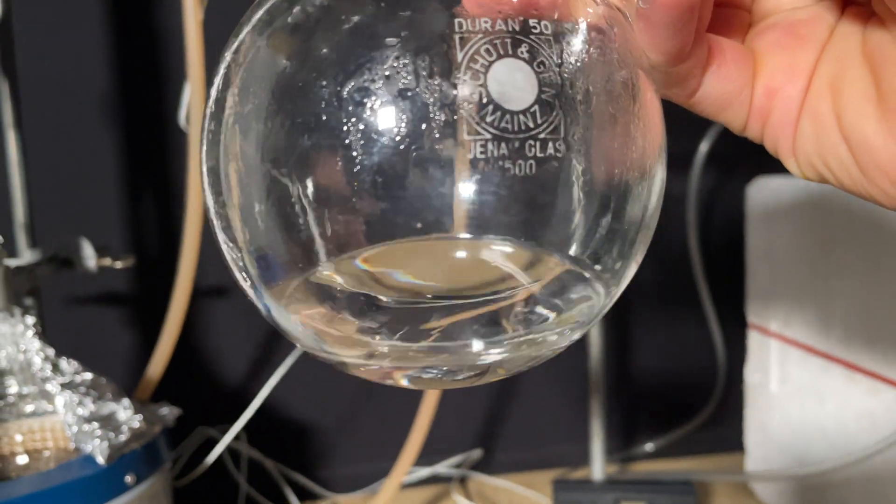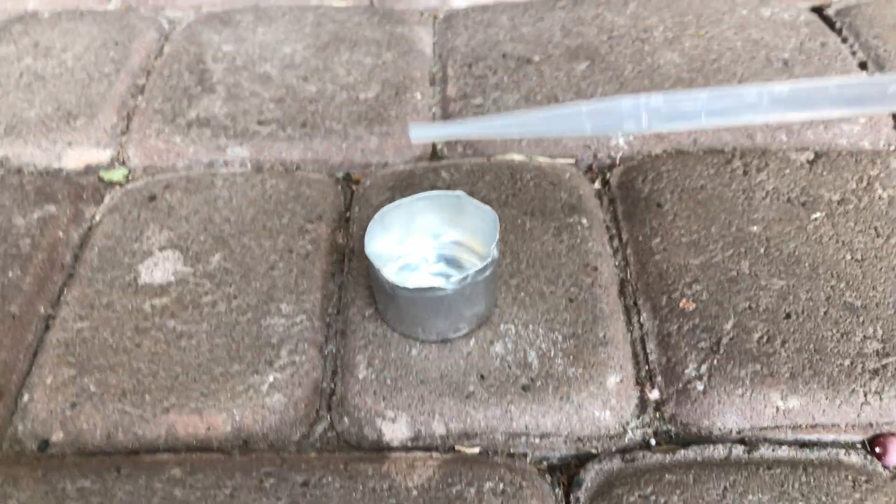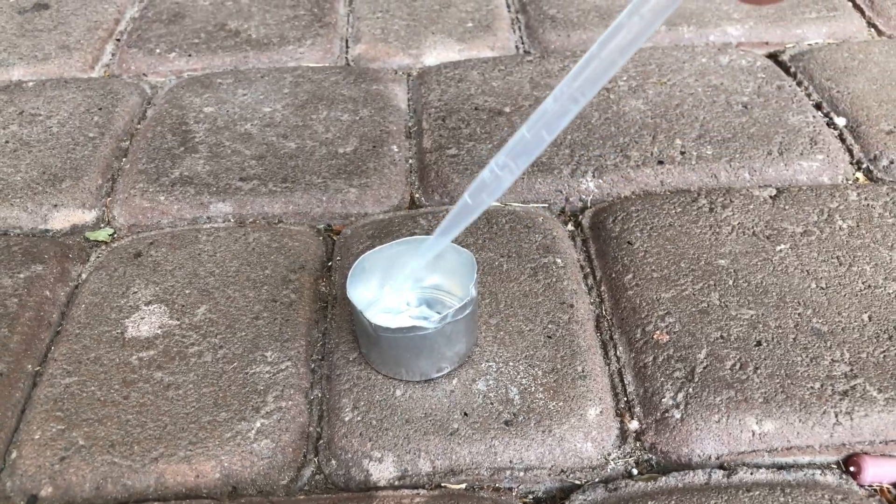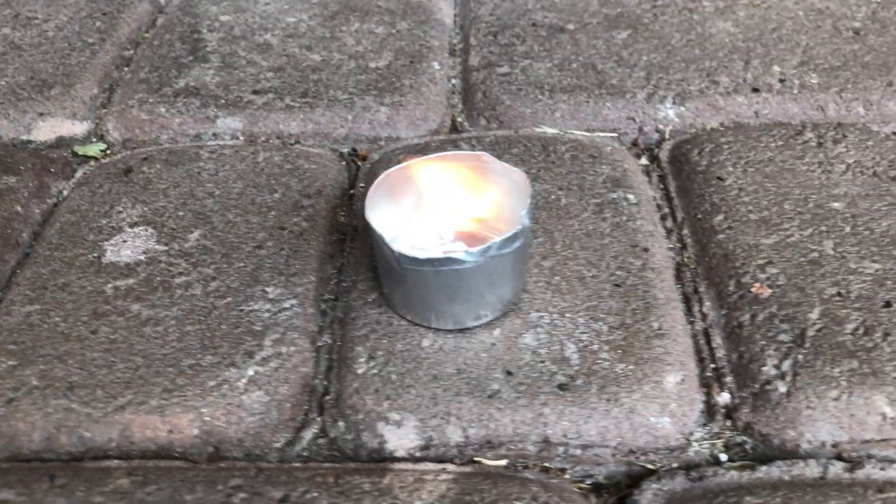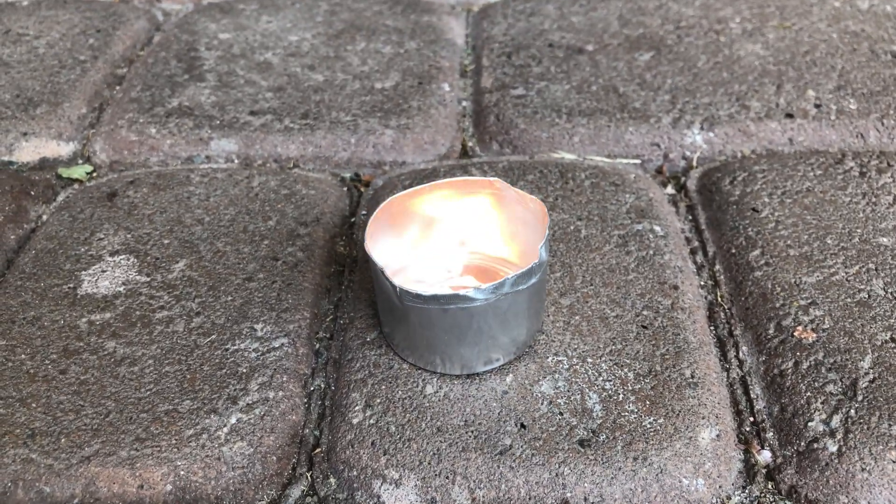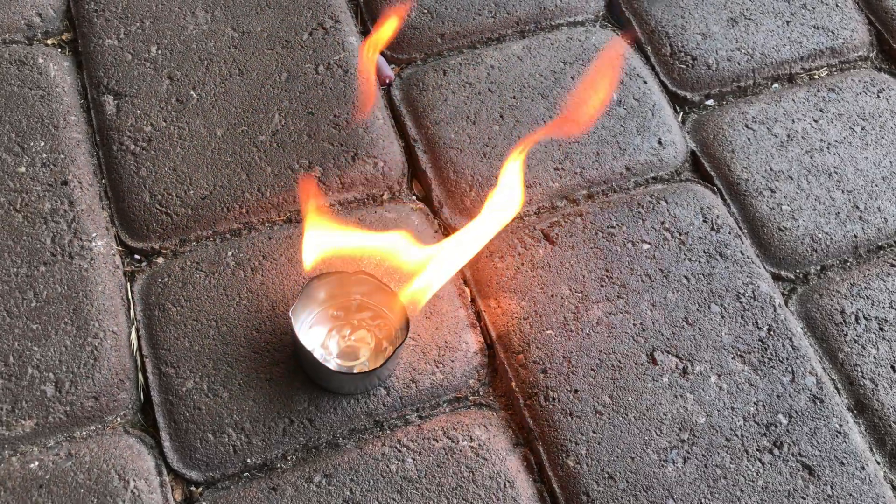Cyclopentanone ethylene ketal is a clear liquid with a mint-like smell and it's very flammable. To demonstrate the flammability we put about half a milliliter into an aluminum can and lit it on fire. It burned well and in the beginning it did not produce any smoke. I allowed it to burn for longer and later on you could see a lot of smoke.